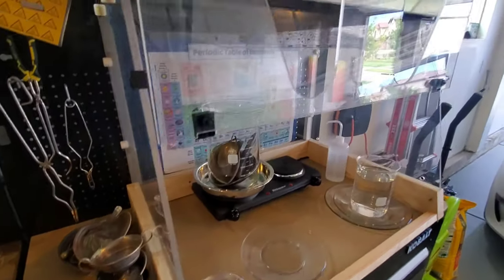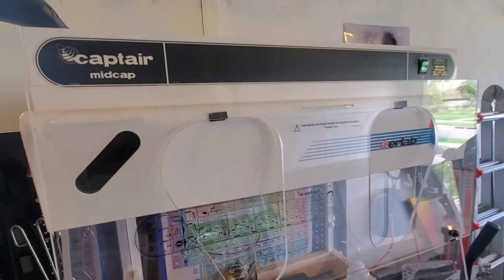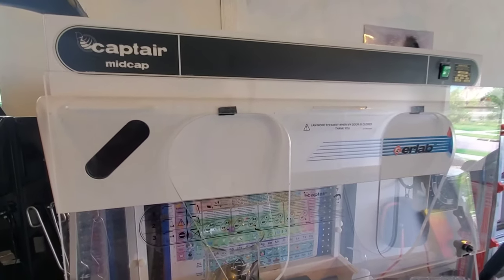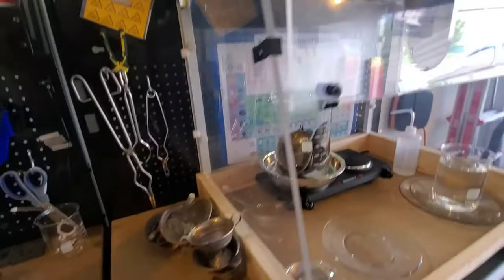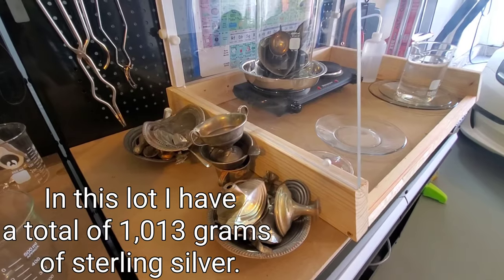A little bit of the setup here. This is all in a fume hood, extremely important as this does give off toxic gases. And then roughly the order that I plan to refine the silver in.